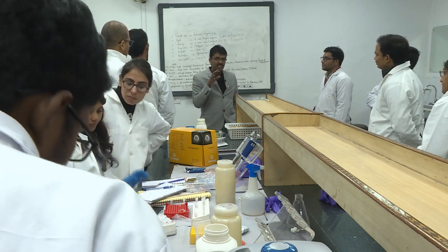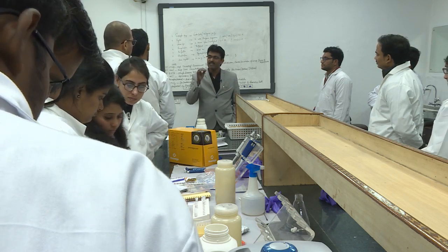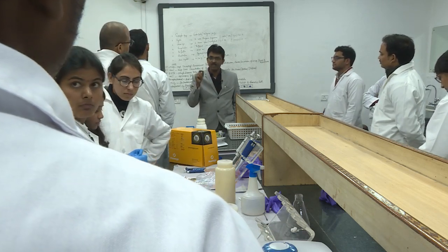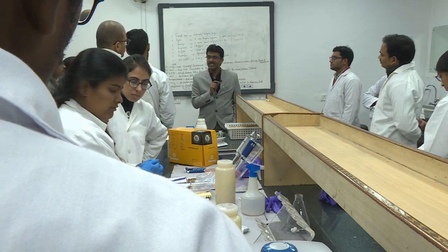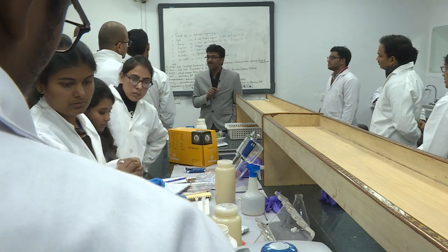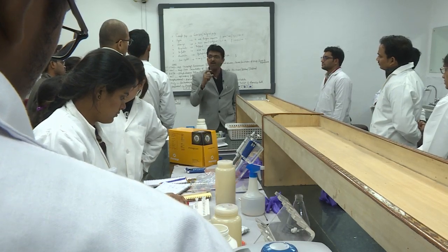If you are handling 15 isolates, all 15 isolates, you make sure that it is only 100 milligram to 200 milligram of mycelium. If it is a bacteria, it is 1 ml, 1 OD, right. This you cannot deviate. Even if it is spore also, you must evolve a strategy to have the same quantity, same quantum of spores.